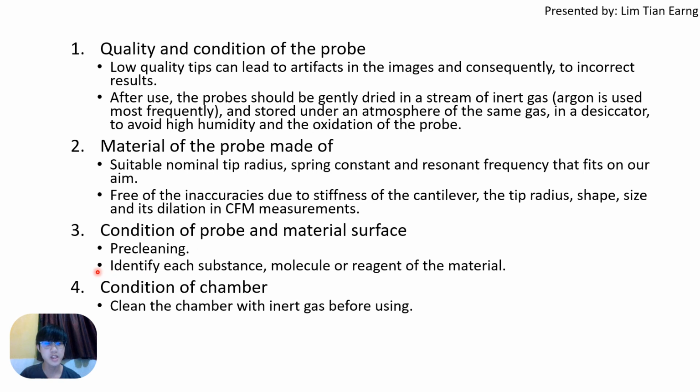And you need to identify the substance, molecule, or reagent of the materials. By doing so, you allow the potential reaction and binding, eventually the complete molecular architectures to functionalize the tip, to be predicted. And this is important as the CFM is used to measure the adhesion force.